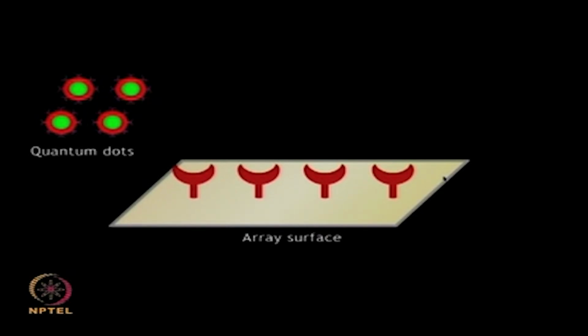The inorganic fluorophores known as quantum dots have been developed that can conjugate with several biomolecules and be used for protein microarray signal detection. They are made up of semiconductor devices which form excitons upon absorption of light, and there is emission of a narrow energy band. When these excitons return to their lower energy level, let us click on these quantum dots to view how they work.